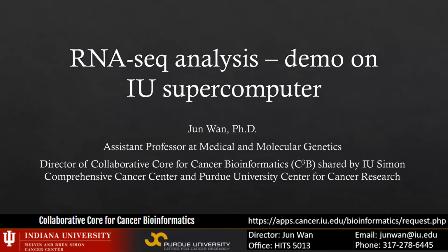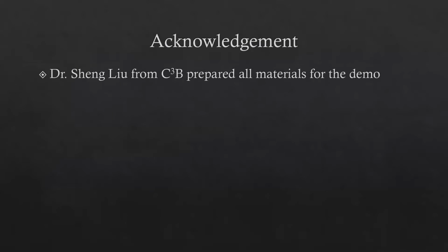I'm an assistant professor at the Department of Medical and Molecular Genetics, and I'm also directing the Collaborative Core for Cancer Bioinformatics, the C3B cohort. And today, I'm going to show you a demo of RNA-seq analysis. We will perform the demo and show you everything on our supercomputer system.